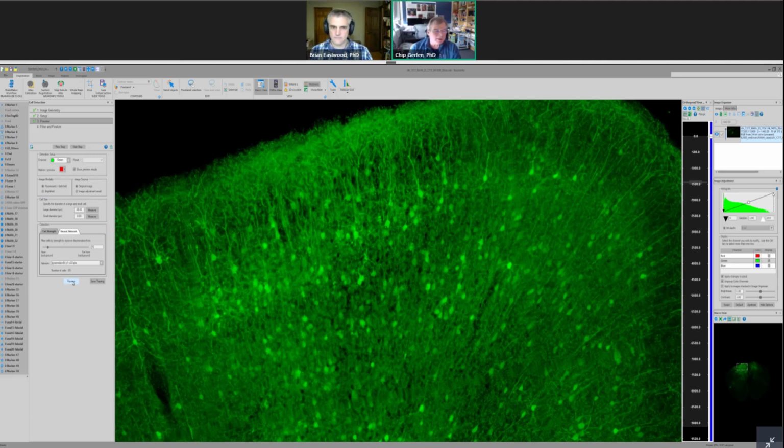And if we now apply the neural network to that, and now we can see that, again, remembering, well, let me just go to what it looks like with the cell strength. So when you look at the cell strength, with the value at 10, it picks up all of the more lightly or less strongly labeled pyramidal neurons, but it also picks up a lot of other objects in the areas where there's a high fiber plexus, and the dendrites are oftentimes much more easily labeled.